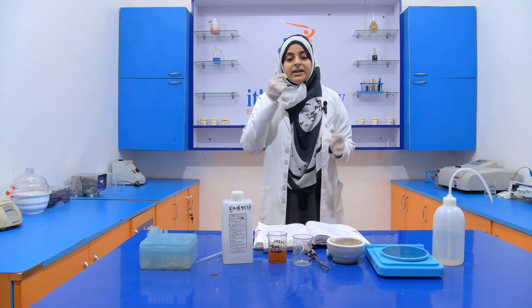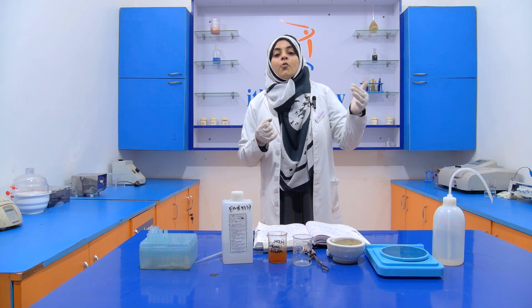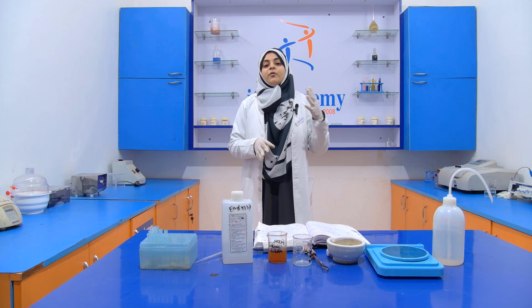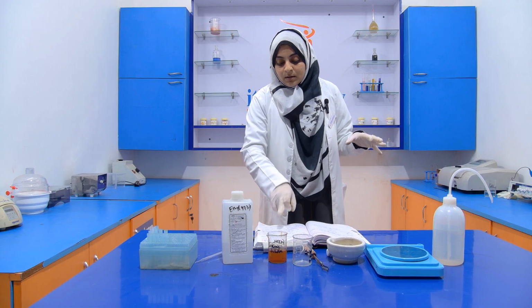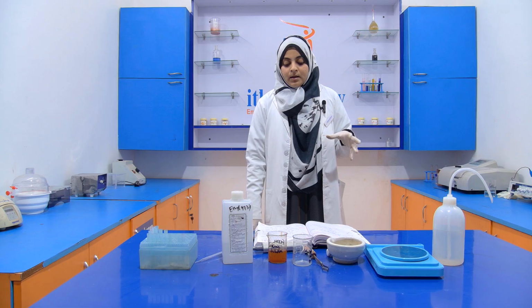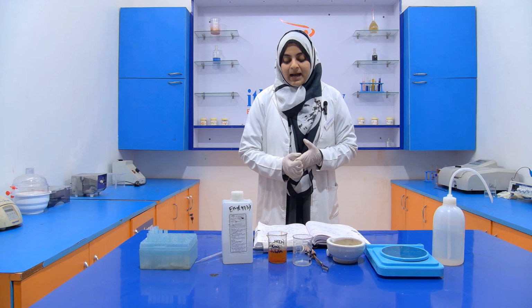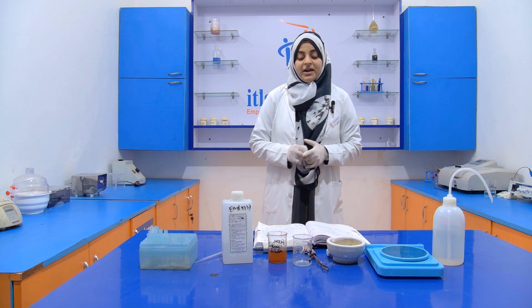That means we take 2 gram of potassium iodide dissolved into 20 ml of distilled water, then add 0.2 gram of iodine, and when it is completely dissolved, we add alcohol, about 80 ml, to make up the volume to 100 ml. So we get an iodine solution. We have to store this iodine solution in a dark bottle.